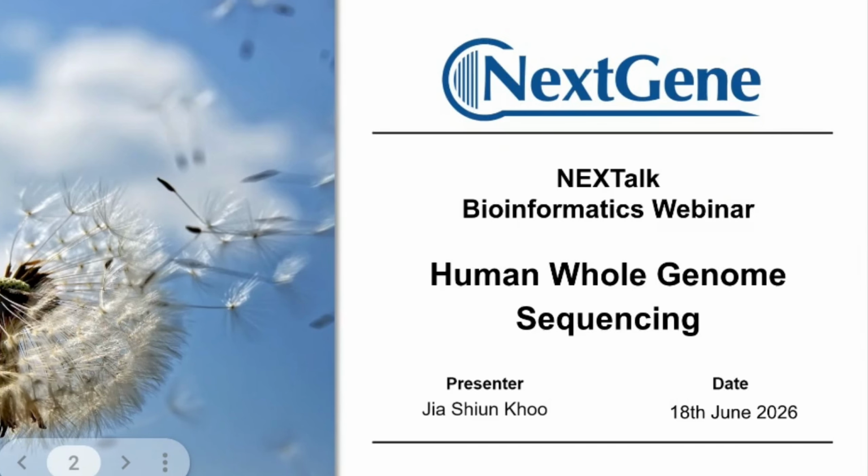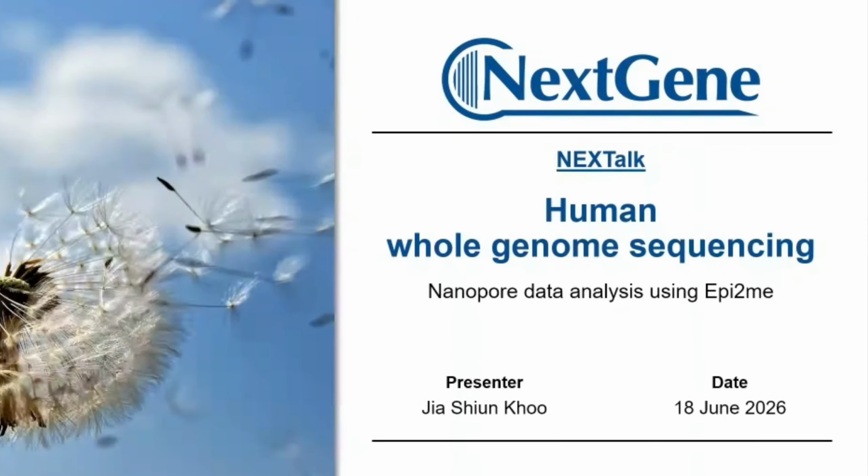Hello, is my mic okay? Yes, your mic is okay. Okay, so let me pull out the slide here. And we can see your slides. All right, thank you. So today, let me adjust my screen a little bit. I'm using two screens over here, so you might see me switching here and there. Okay.